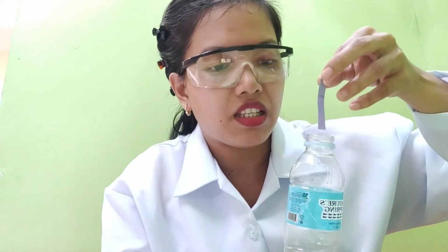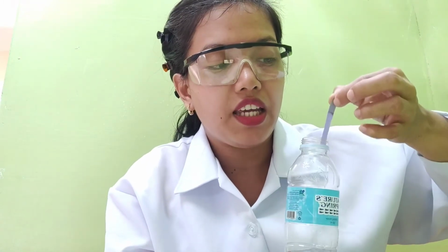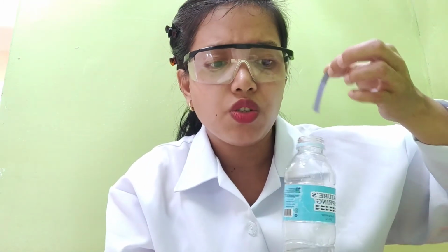Here. Okay. So what happened is, the blue litmus paper stays blue. So what can you say? Is it a base or an acid? Okay. Earlier you noticed that when we used the red litmus paper, it stayed red. And the blue litmus paper is still the same, it stays blue.